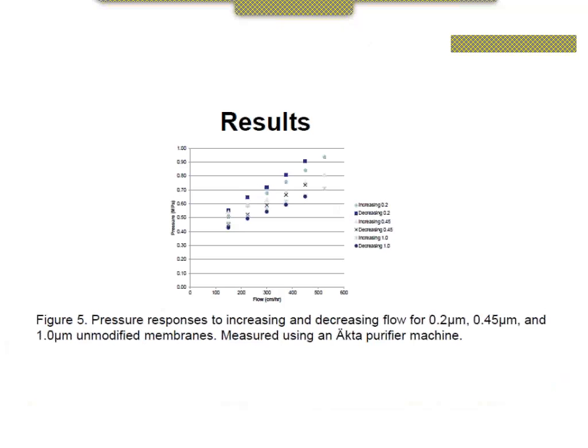And in this graph, you see that increasing flow increases the flux, but also increasing the flow increases the pressure, not as dramatically as you would expect. So increasing the flow doesn't have a big effect on pressure.